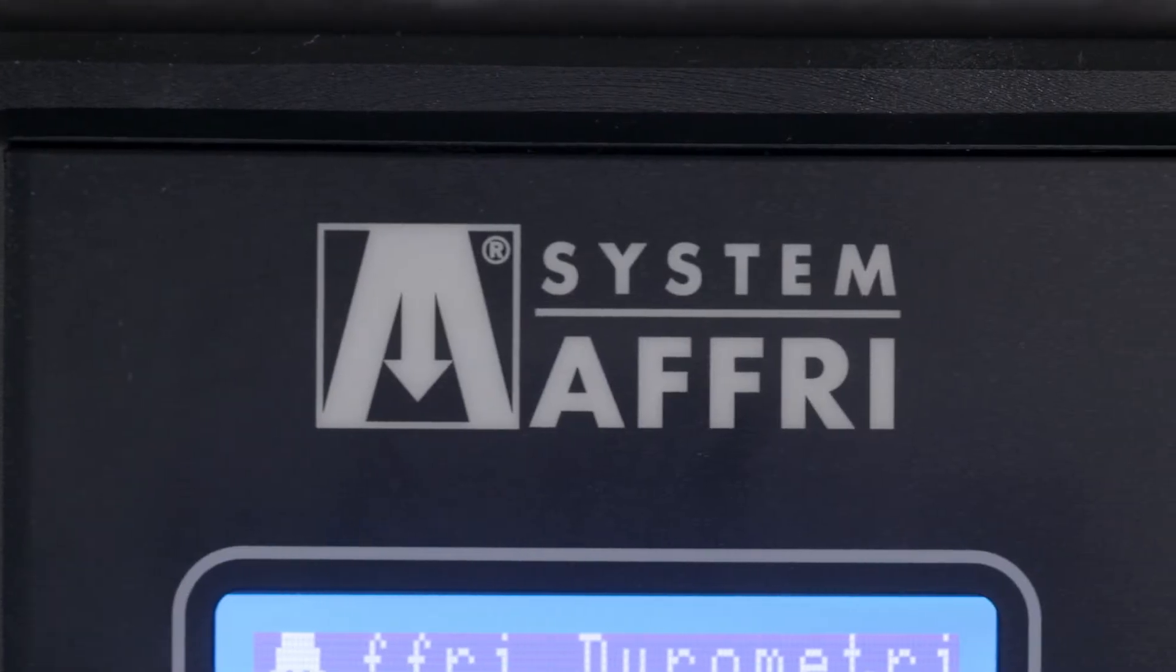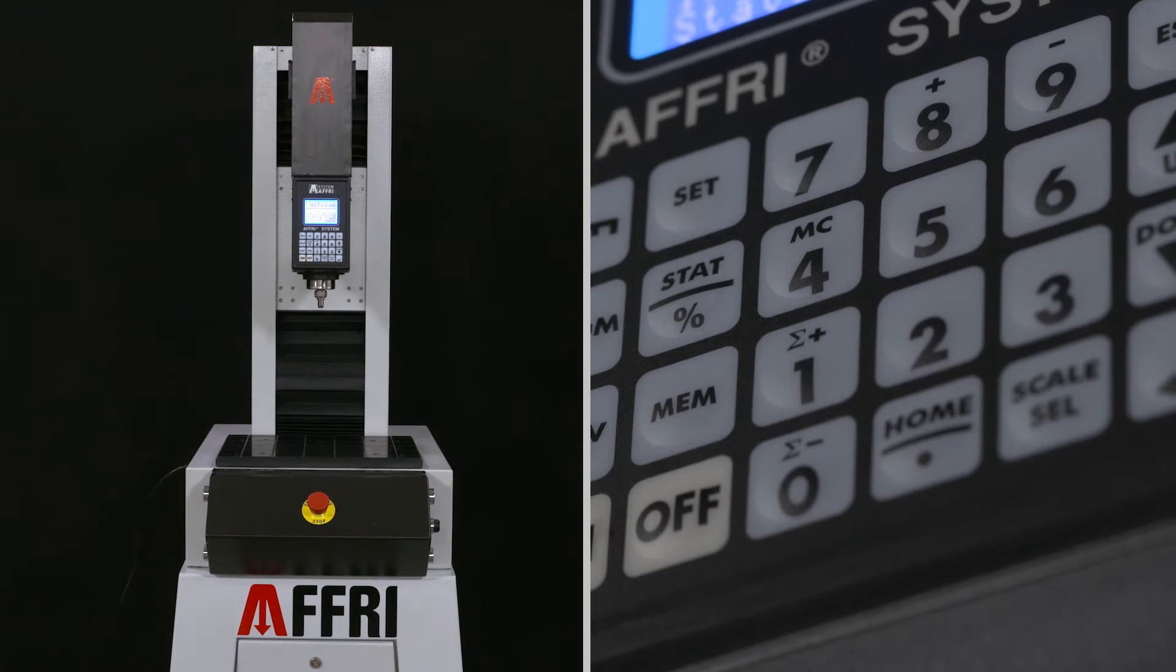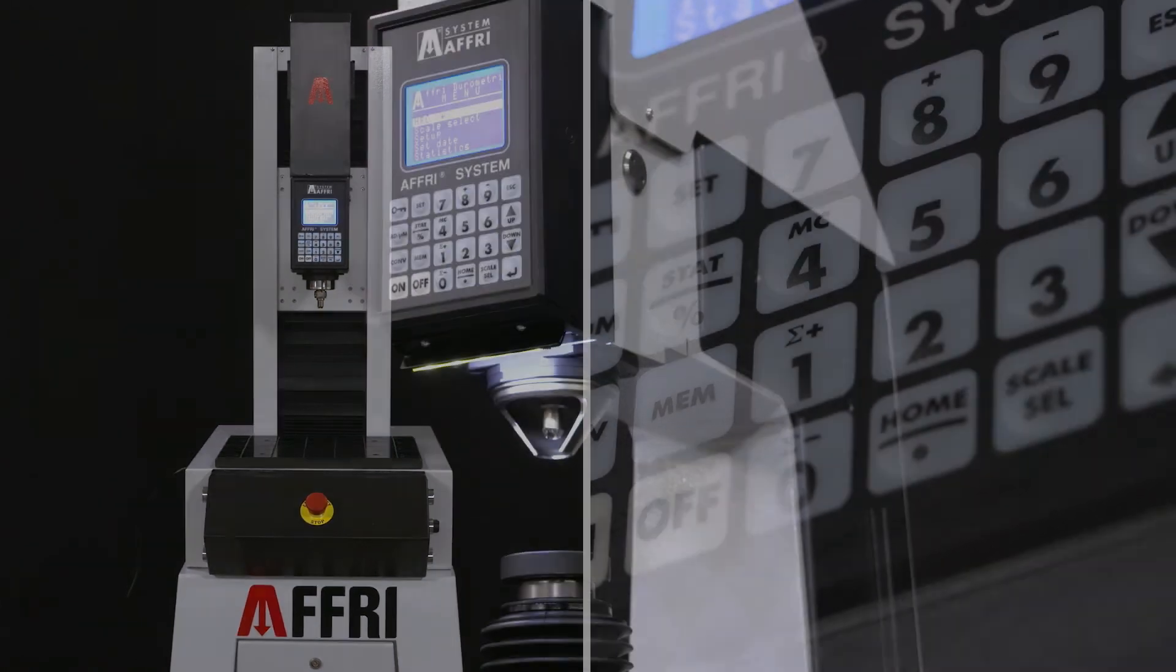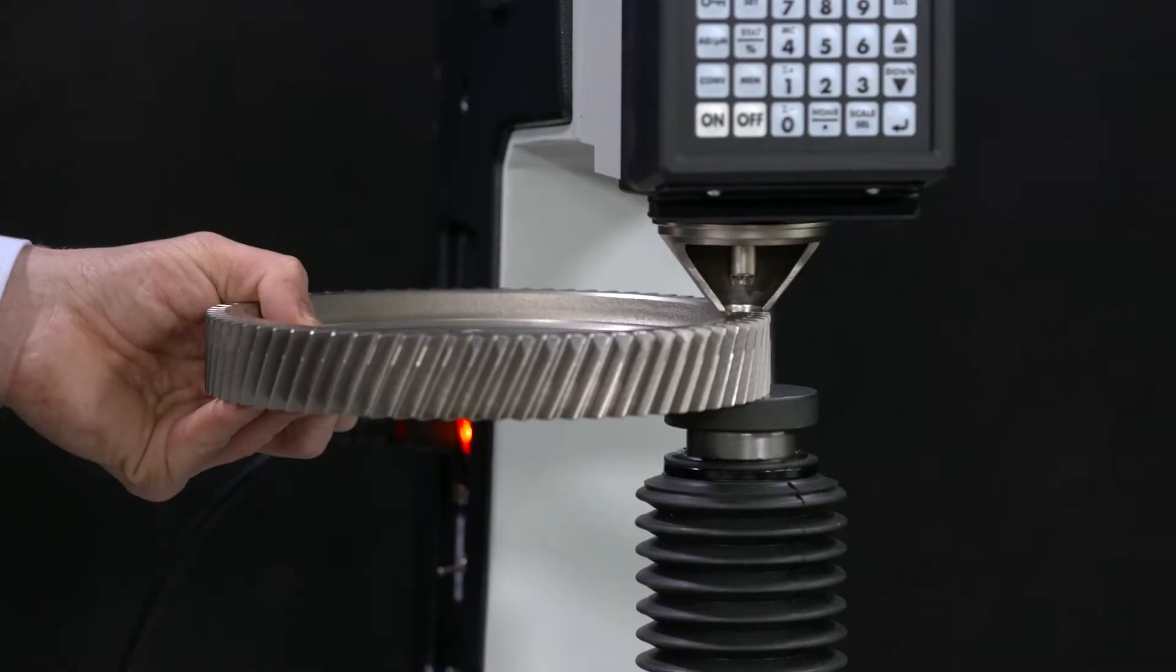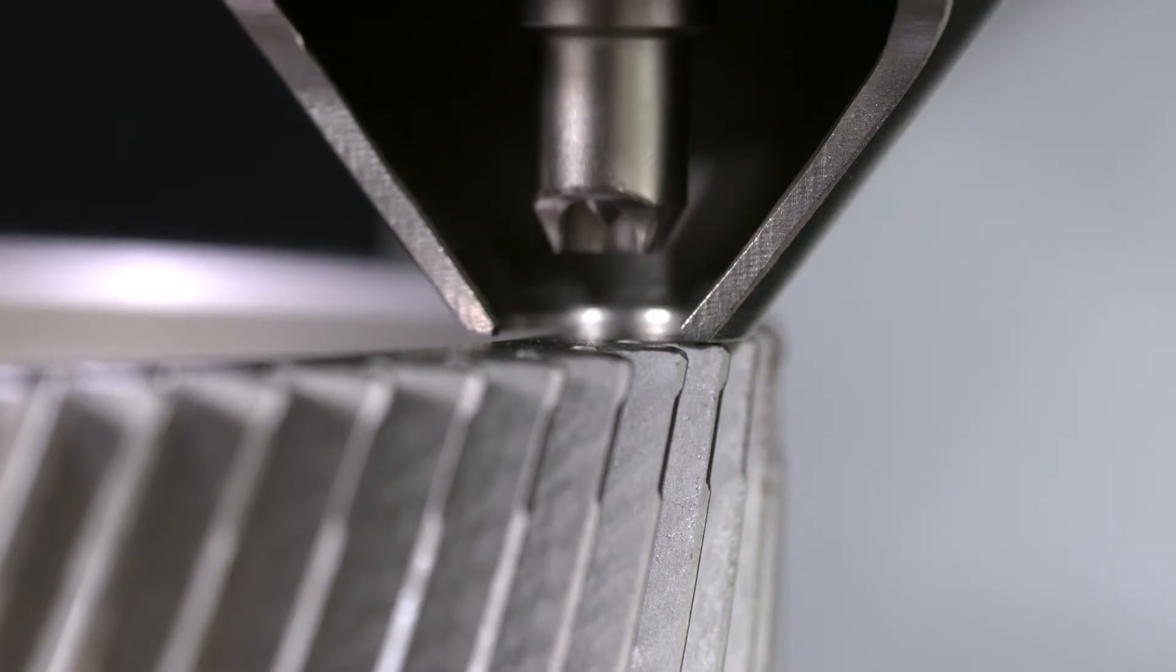Extremely precise results can be obtained even on unstable, dirty, oily, unbalanced, or heavy pieces. There is no risk of the sample moving or producing an incorrect reading.